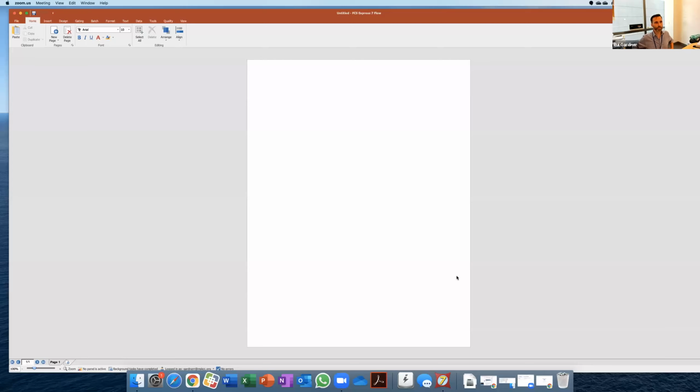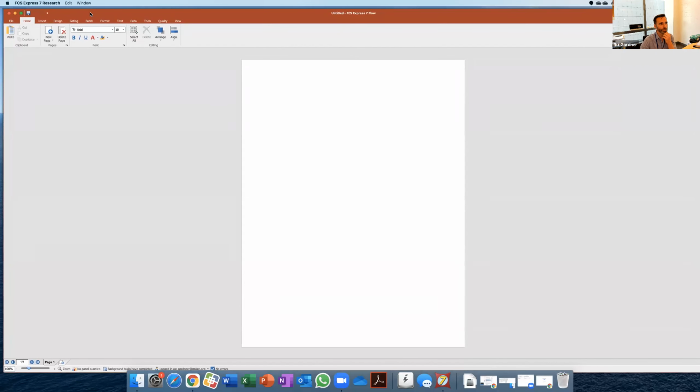So I'm going to share my desktop and start. Usually FCS Express starts with a pop-up window, which is quite handy, and this time it's just refusing to start with that window. Oh, here we go, startup screen.